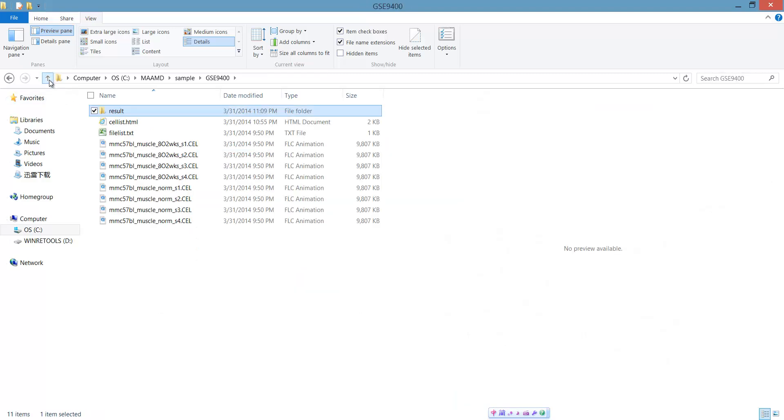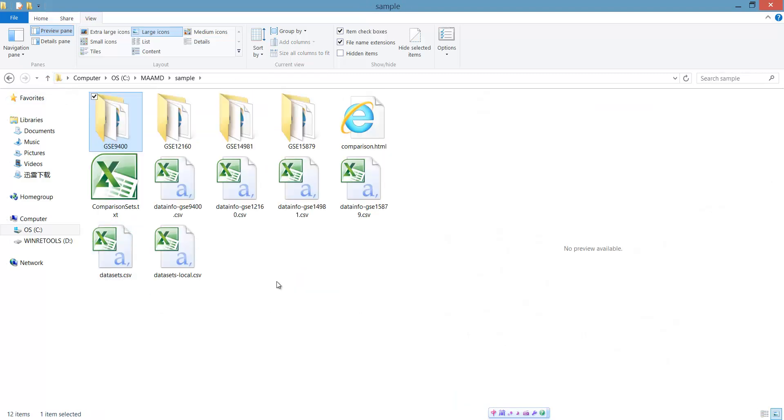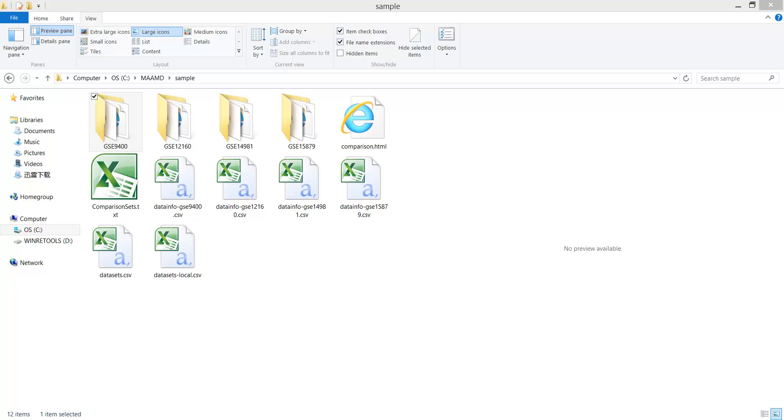So the whole process took about one hour to finish the analysis of four datasets. In summary, MAMD integrates microarray data and their analysis and hence improves efficiency and accuracy for the analysis of complex datasets.